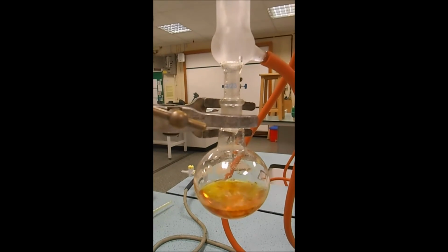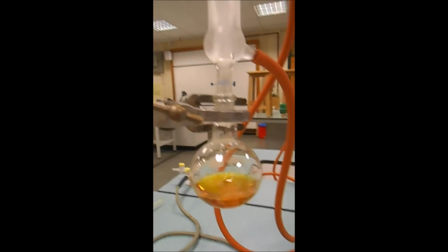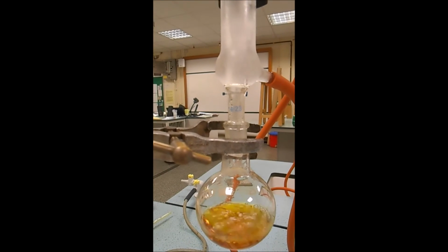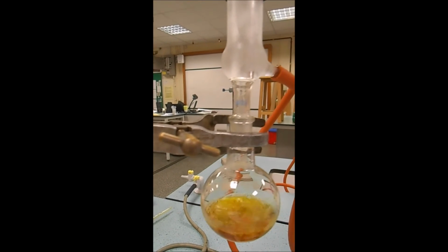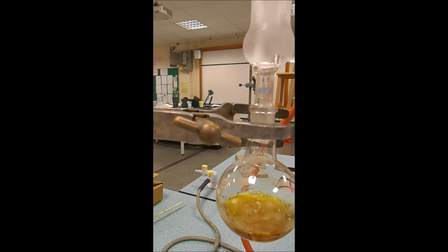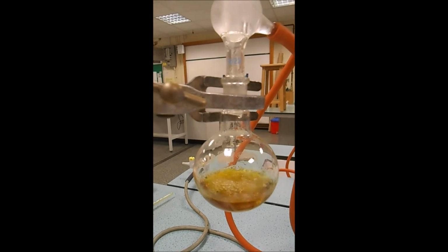Now, can you see the fog at the top here? Okay, that is the evaporating substances condensing on the side and then dripping down. You can see there's a kind of fog layer heading its way up the condenser. We do not want that to get to the top. If it gets to the top, it's too hot. Okay, so we're just going to leave that there until it comes down a little bit.